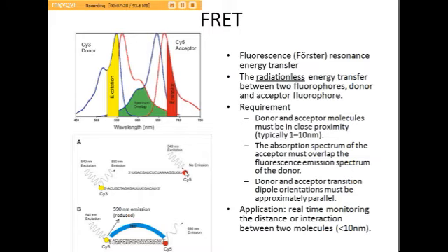However, if you look at Cy5's excitation curve at the 540 nanometer region, you can see its absorption or excitation is very weak. Since there is no excitation or absorption here, there will be no 680 nanometer emission. So in this case, the emission is all contributed from Cy3.